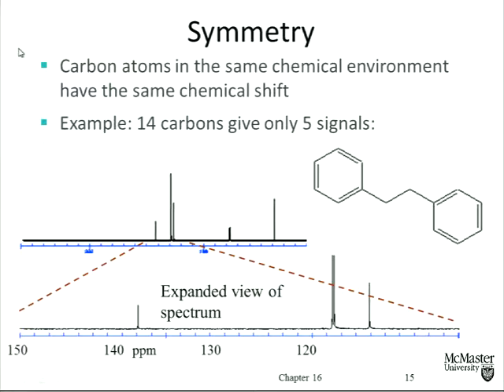The other benzene ring is going to give us 4 signals. So do we expect to see 8 carbon resonances? The answer is no, because there's a further element of symmetry in this molecule, right? The two benzene rings are equivalent to one another. If I go straight through the center of the sp3 hybridized carbon-carbon bond and just turn the molecule around, that benzene ring goes to there, and the other benzene ring goes exactly to where the first one is. So there are 4 resonances for that.